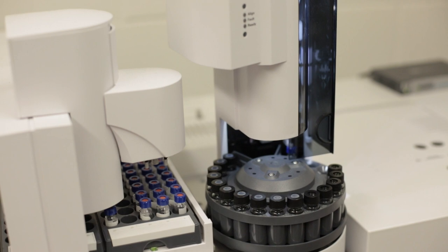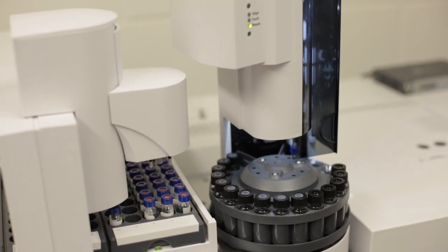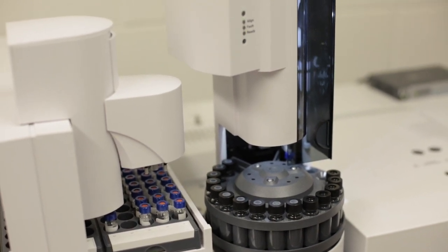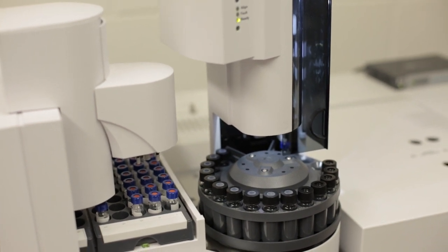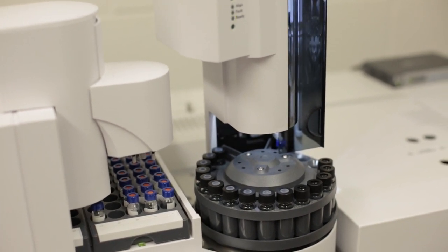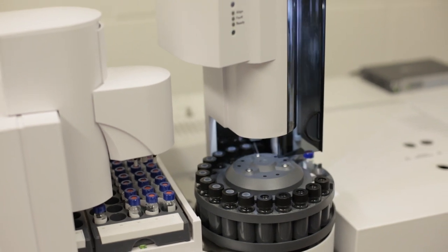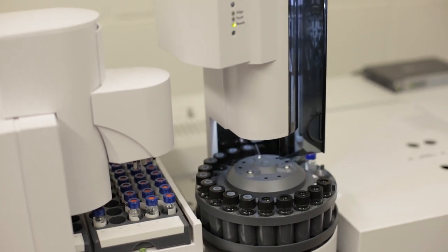Now it's going to pick up some sample from the vial we've just prepared. Rinse the syringe with that a few times. And then inject it onto the machine. So it's now on the chromatography column and the chromatographic run takes about 19 minutes.